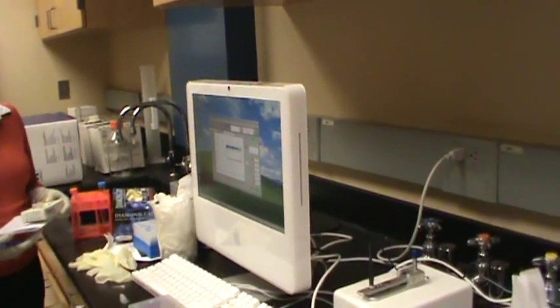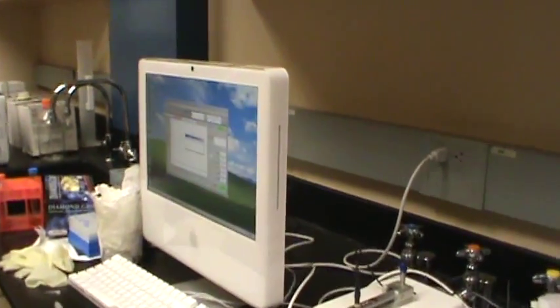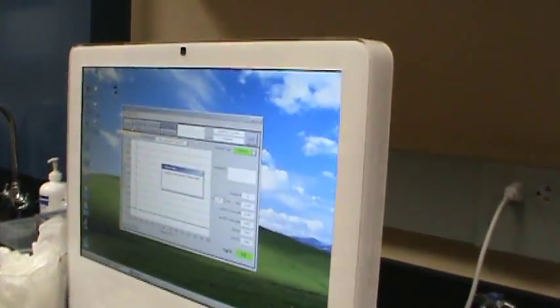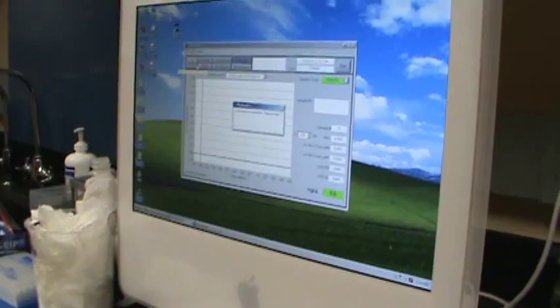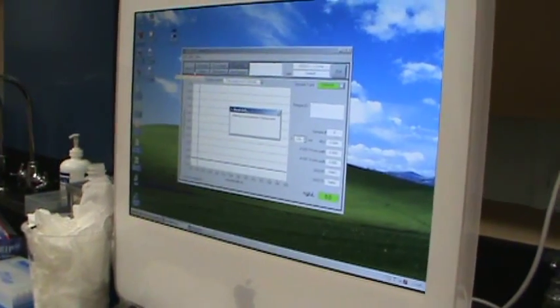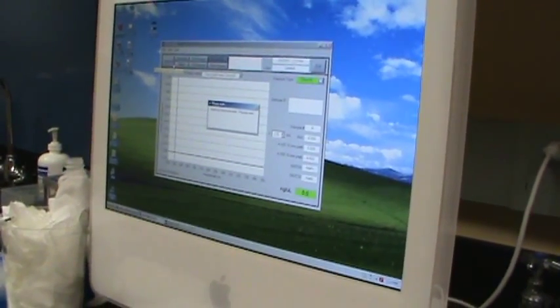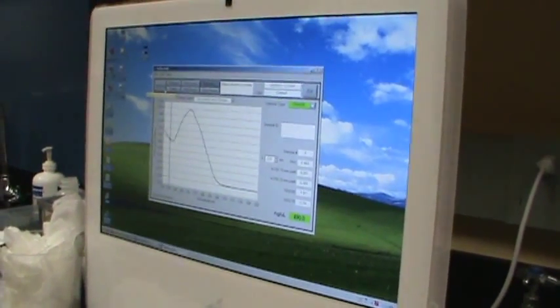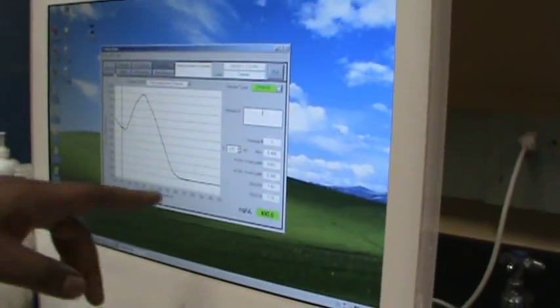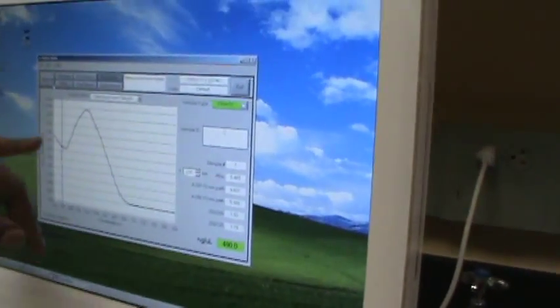When you put that, it measures it. Yeah, now it's making the measurement right now. Okay, so this is really good.